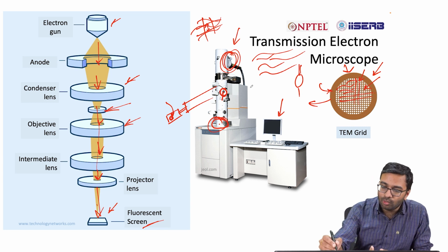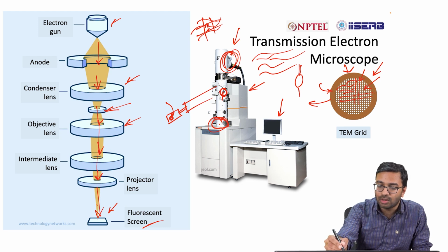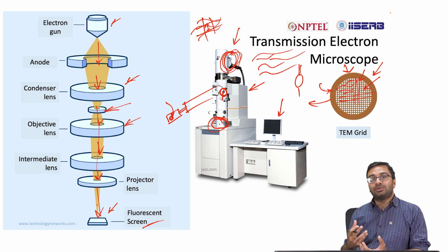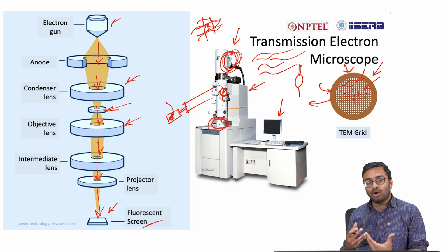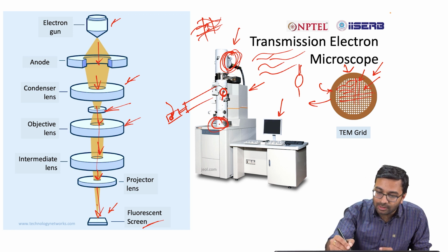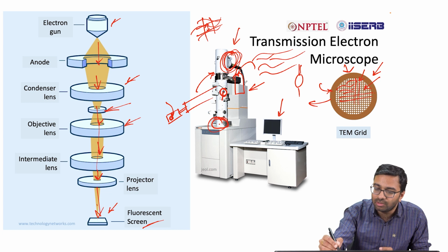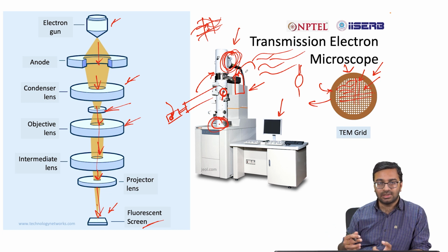Usually these equipments require liquid nitrogen, because the electron beam is of high energy, so there is a lot of heat that it generates. That's why we need liquid nitrogen. So you usually find that there is a liquid nitrogen chamber, maybe on that side of that image you'll find it. You fill this with liquid nitrogen, and then you start your analysis. This is the usual process.